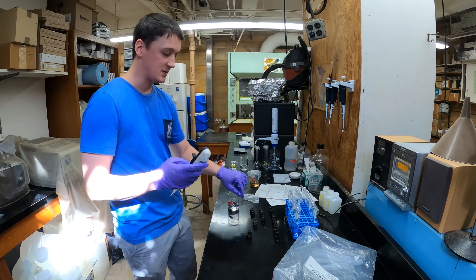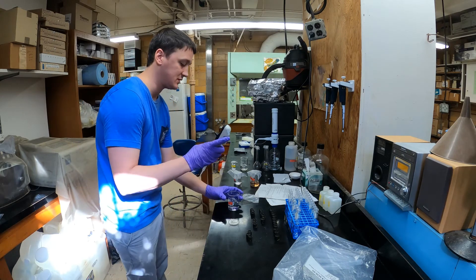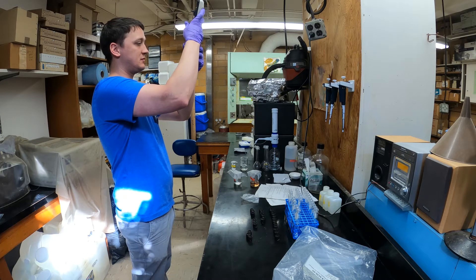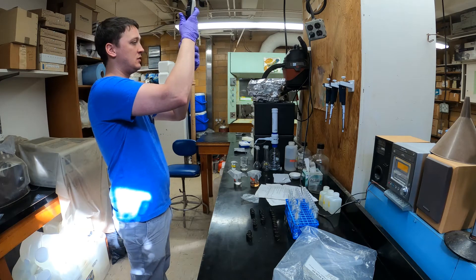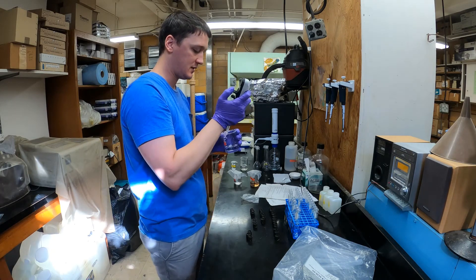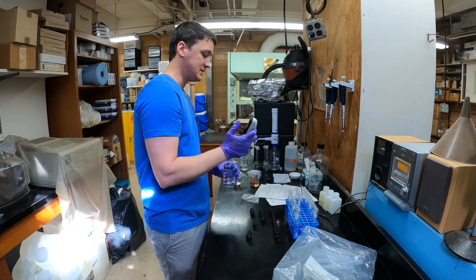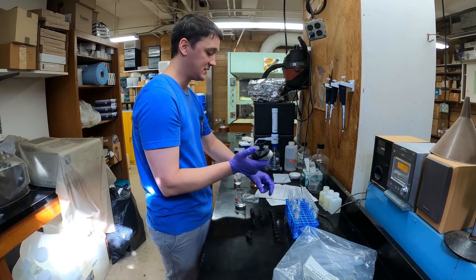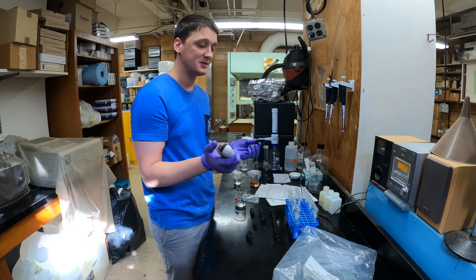You can see I've got all the test tube caps off. That's so as I'm going along, it's easy to keep track of which test tubes have gotten the reagent — it's really easy to miss a test tube or forget where you were when you come back to refill the tip.